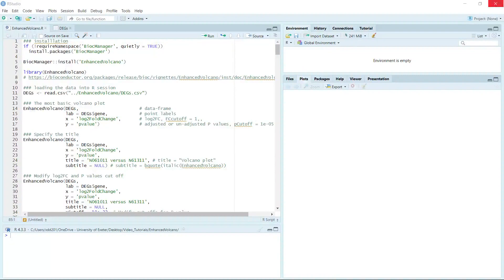Hello everyone, welcome to my video tutorial for the volcano plot. I'm going to show you the enhanced volcano plot package. This package is very easy for you to learn and generate a beautiful volcano plot. If you want to use this package, you can install the enhanced volcano plot package. We also have an online tutorial.